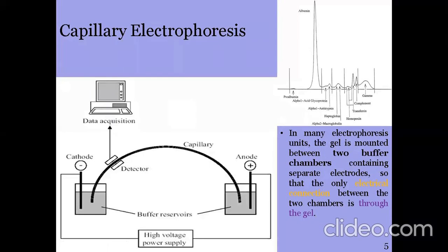like for sequencing. We do capillary electrophoresis, and for some other uses, we have technologies like Agilent technology. I will write it out for you.